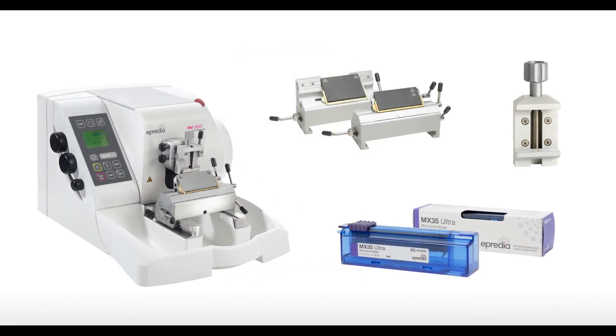Epredia offers the complete solution for lab sectioning samples with its range of rotary microtomes, accessories, and microtome blades.